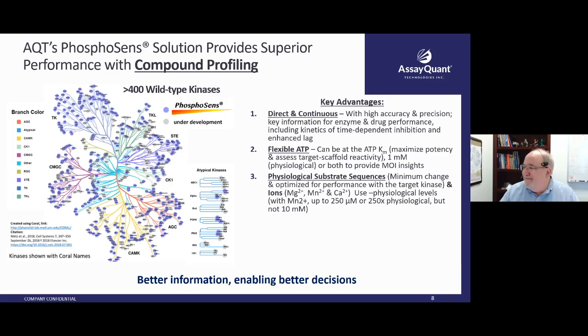Great. You've touched on the fact that we're looking at 1536 formats. Can you talk about how we're validating that assay format and what projected schedule would be to move forward with that? Well, that's something we're very excited about, and it's something we're pushing along in parallel right now, and also competing with the installation of our latest full automation capability right now.